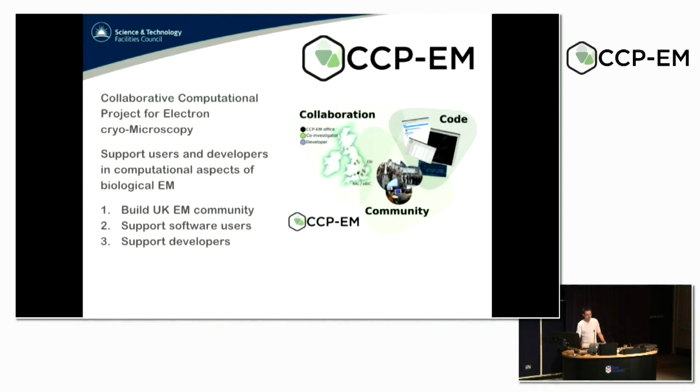So CCP-EM, as you should know, is the collaborative computational project for electron cryo-microscopy. And we aim to support users and developers in the computational aspects of biological EM. And so we have 3 principal aims that we try and fulfill.